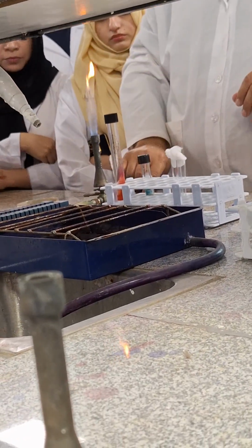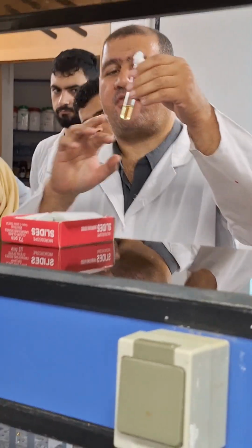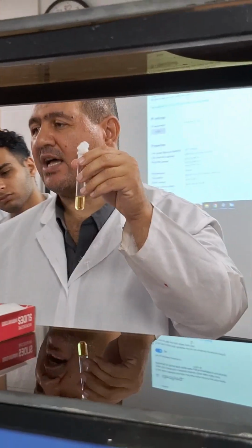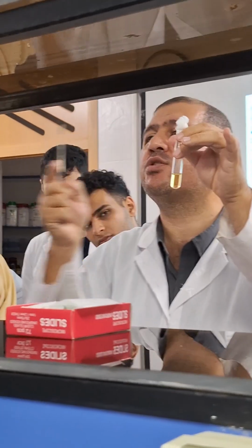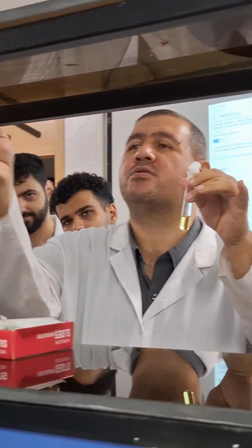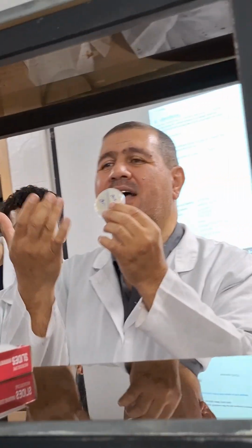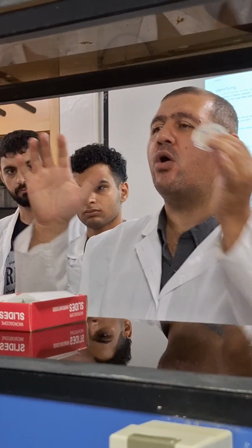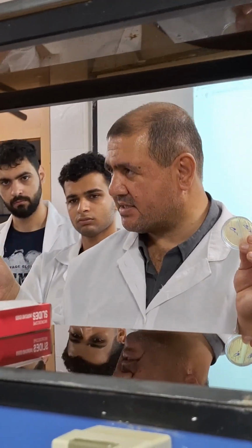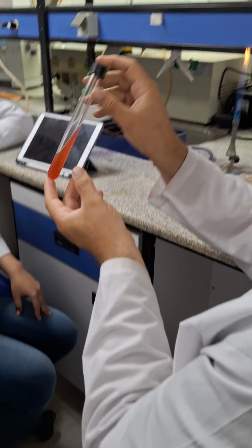Pay attention to transfer bacteria from liquid media to solid, we use loop. Liquid to solid, we use loop. To transfer from solid media to liquid, you can use loop or needle, both. You understand? Yes. Let's spell that. Slant.